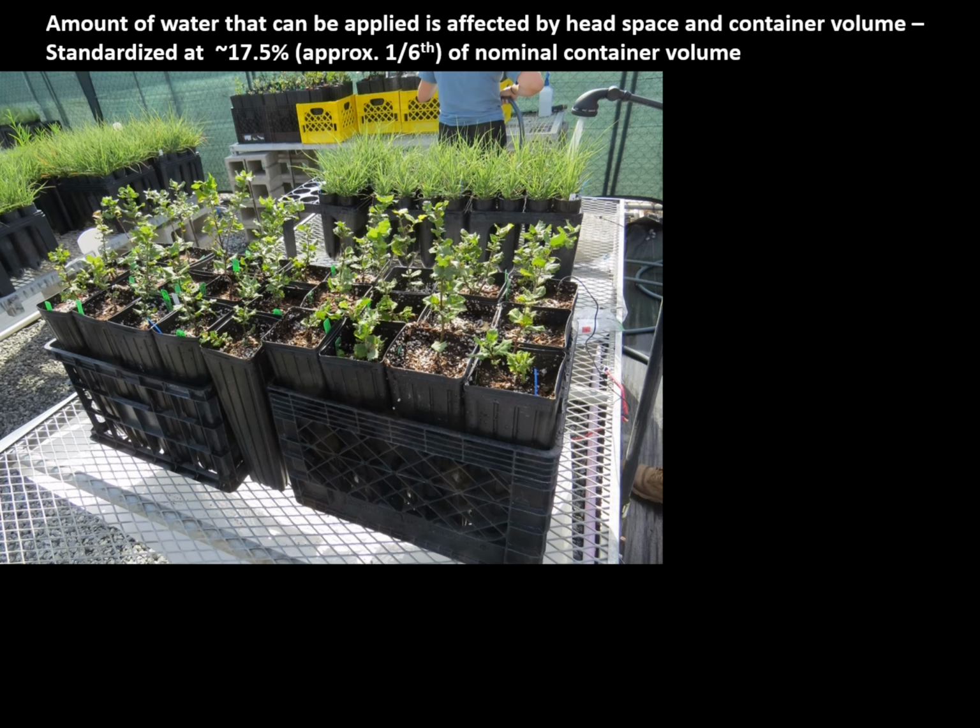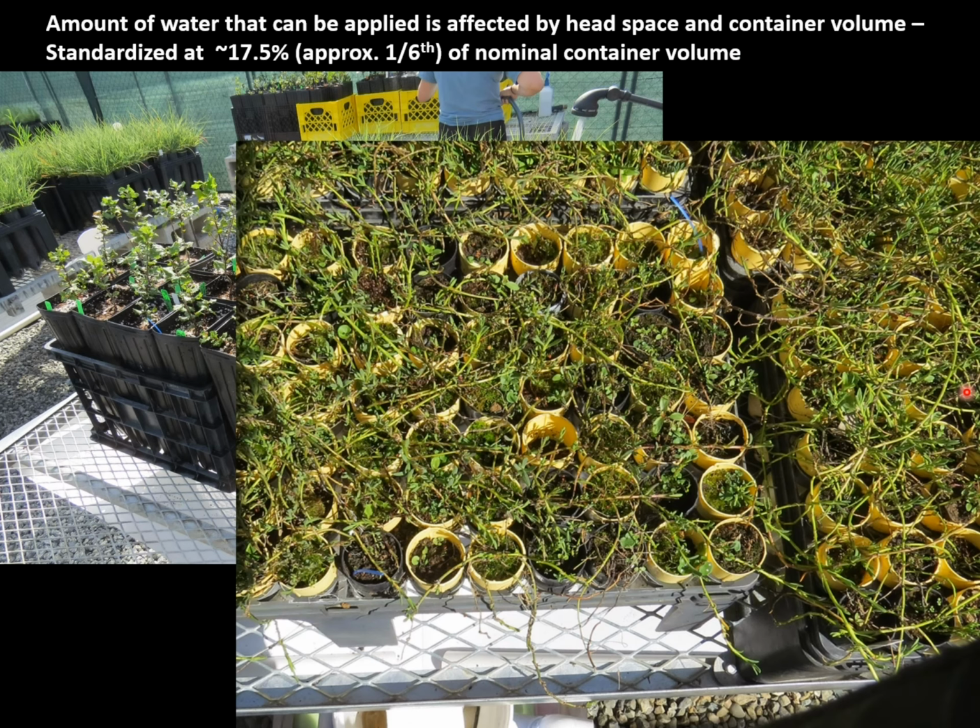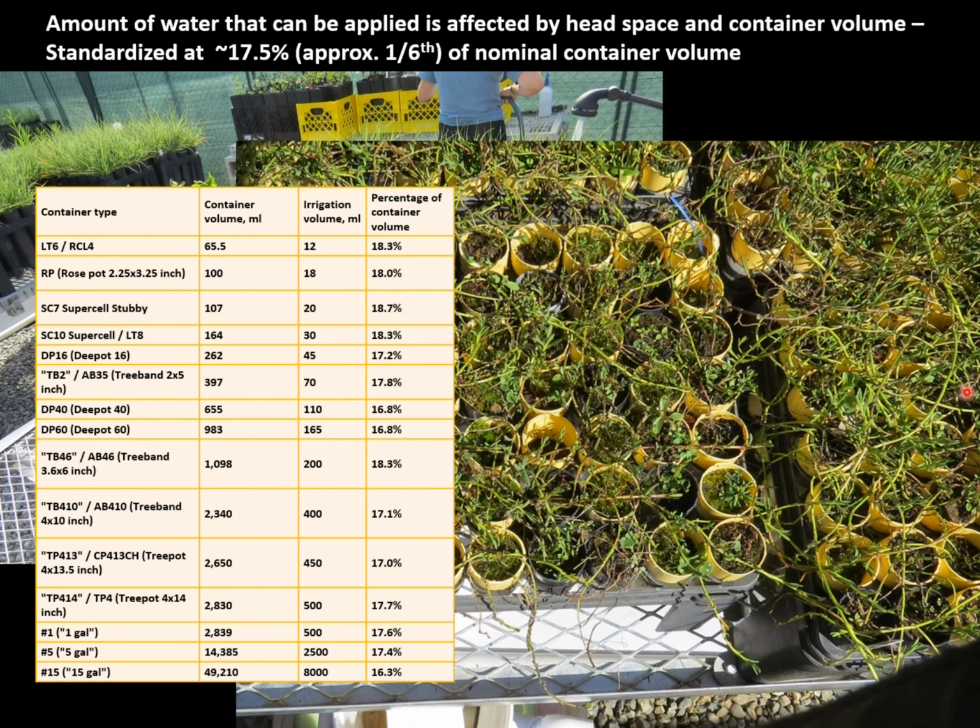And so through a number of tests, we ended up standardizing at around 17.5% on average of the nominal container volume. That's roughly about a sixth of the container volume. Whether you're working with containers of this size or very small containers, you can make those calculations, and we have these on the website. But you'll see that if we have a very small container, we're not going to apply very much volume of irrigation.